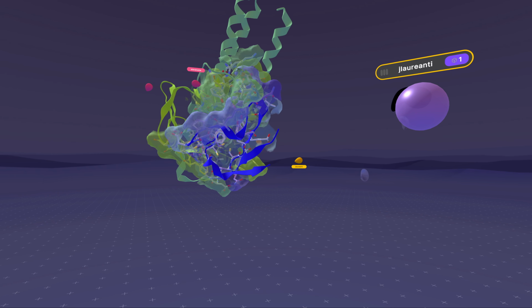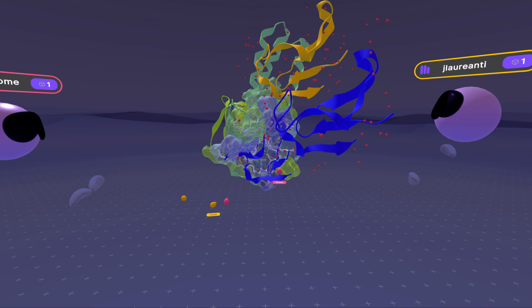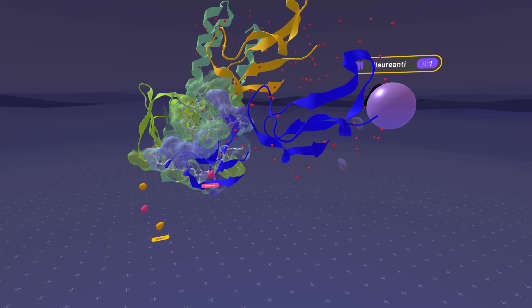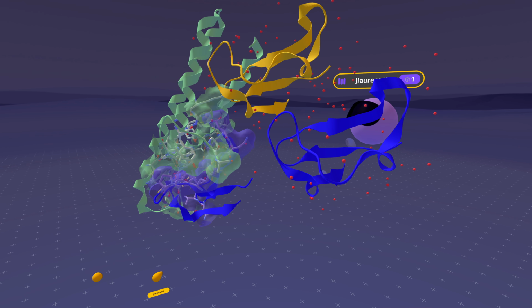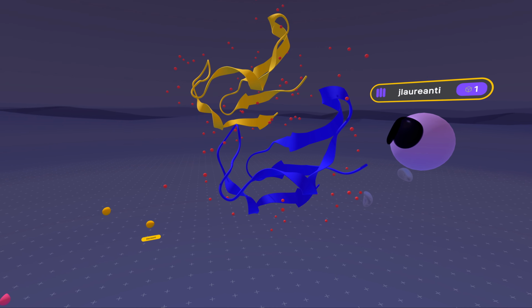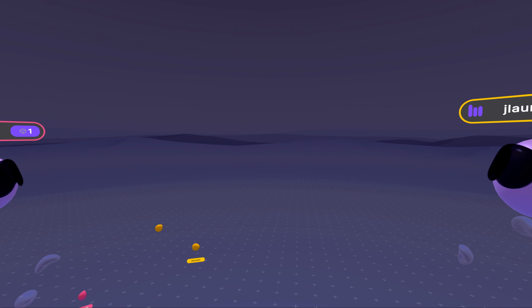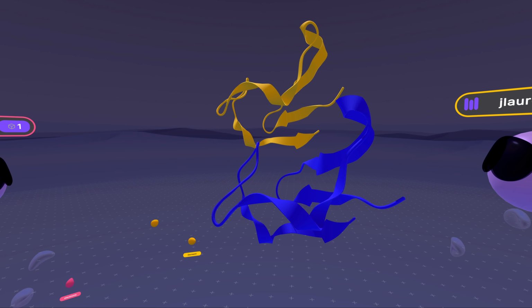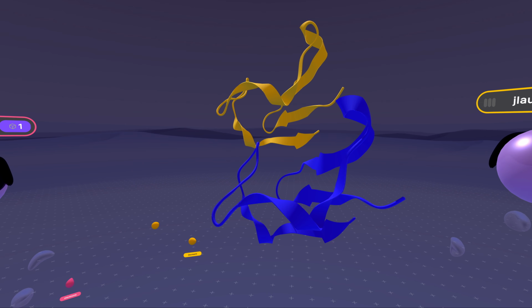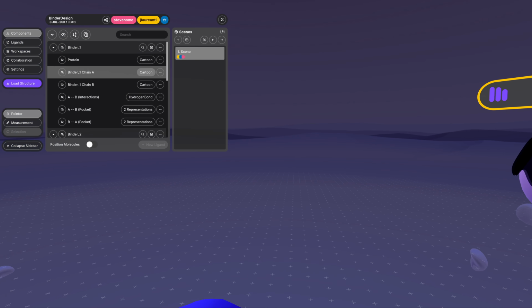You also had the PDB 6NW1. Yeah, so this is the starting protein. It's technically an enzyme. It's an artificial metalloenzyme that converts protons and electrons to hydrogen gas. It's got a little nickel atom in there as well, but what I was trying to do was find a binder that would kind of cover the active site.